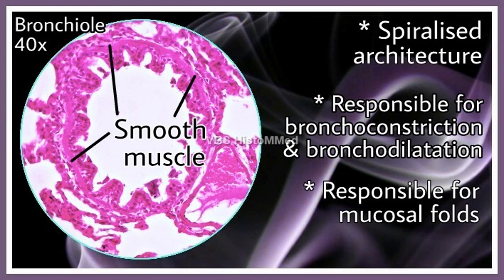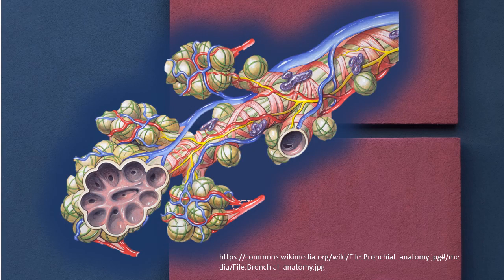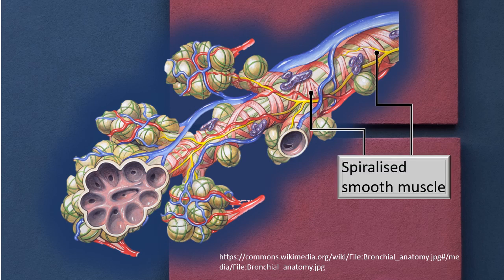This photograph gives a better picture of the spiralized architecture of smooth muscle. You can beautifully see how the smooth muscle fibers are arranged in a spiral design around the mucous membrane.